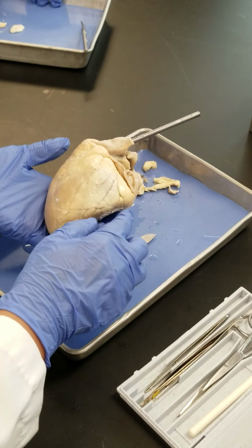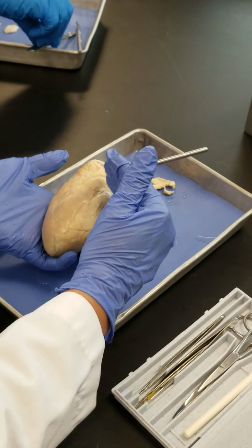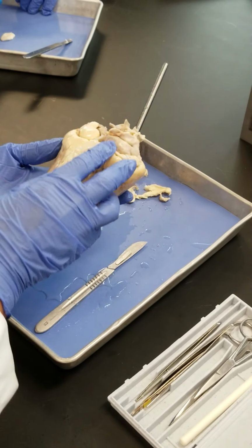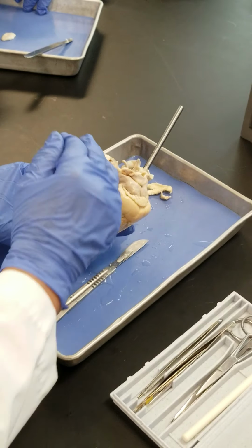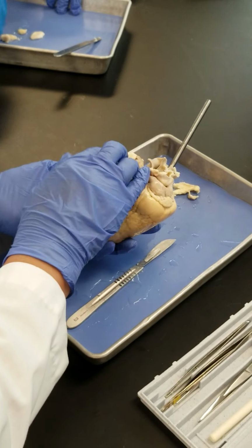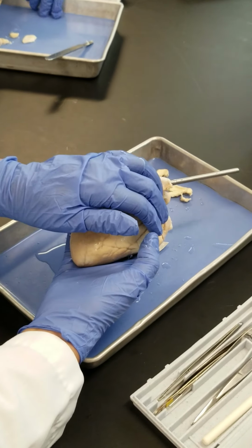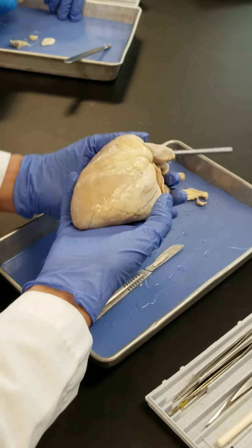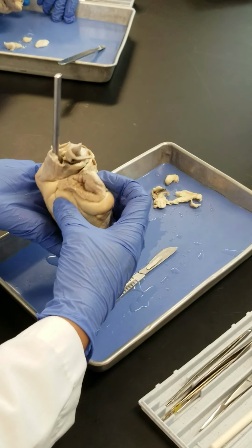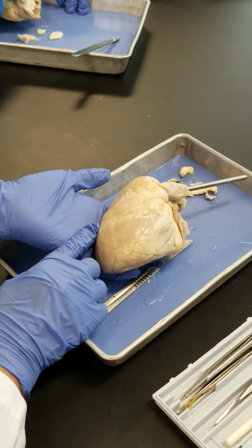This side is the anterior side of the heart, the one where the coronary sulcus is higher, and you see less of the vessel here compared to this side, where the coronary sulcus is lower and you see more of the vessels, and also you see the two atria better on this side. When you look at this side, you don't see much of the atria here because they are located toward the base of the heart, to the superior part of the heart, and they go mostly toward the posterior side, right? So this one is the anterior interventricular sulcus.